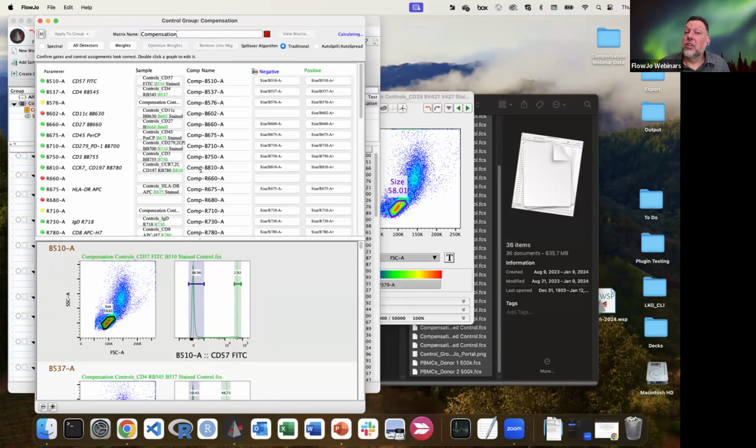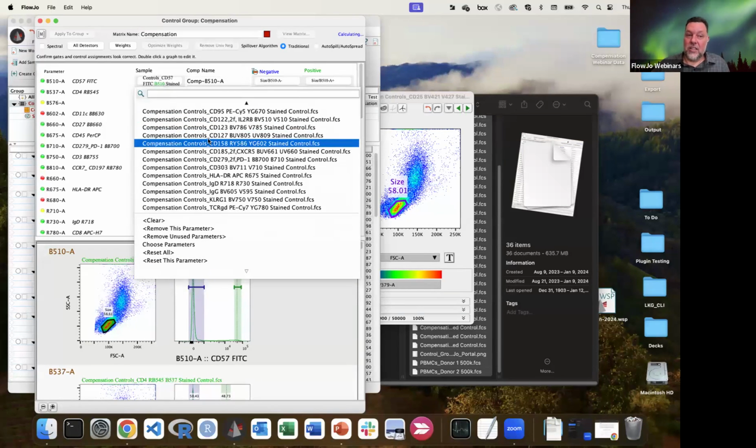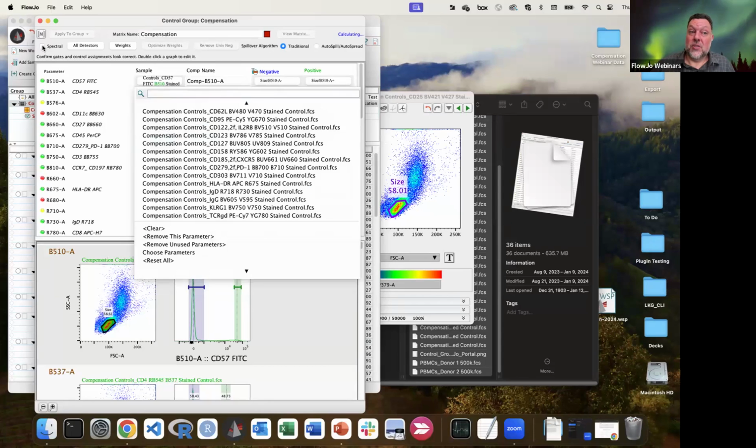So here, I'm not going to go through every step. I have this pre-canned, I'm going to get there, but I'm basically going to go through and say, did it assign the right thing and do I have good positives and negatives for every channel, right? I can do these one at a time. When I click on this list, I get all the compensation controls and the option to remove or choose the parameters to consider, right? I'm going to do a spectral calculation here.